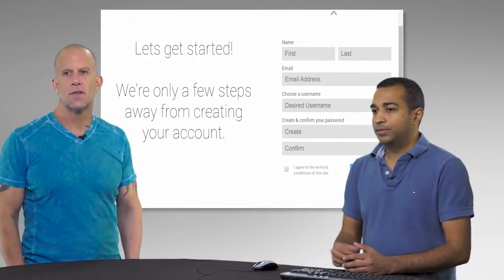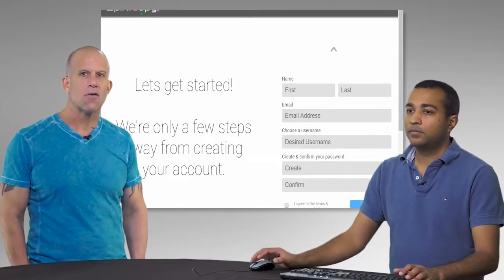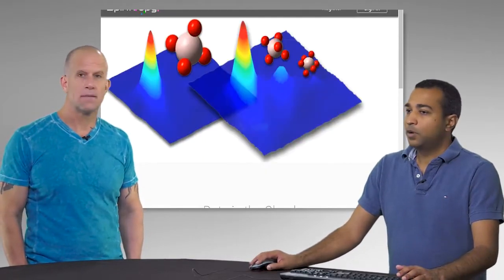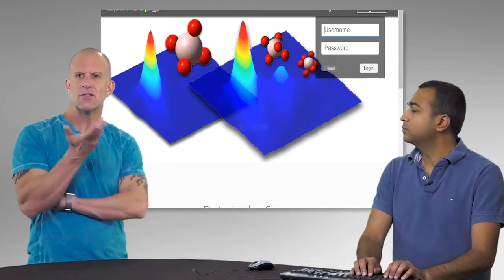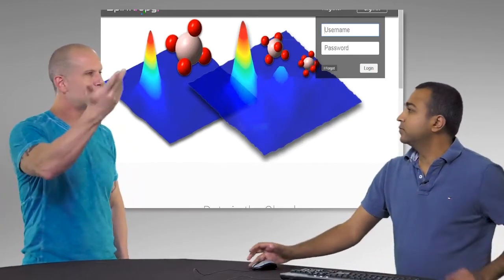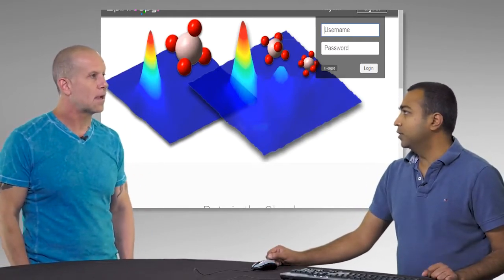Okay, so let's assume that somebody is already registered, so they know their username, right? Right, they'll know their username and password because they set them up. And I assume if they forgot it, there's a forgot link that sends them an email and resets it. Yeah, as long as you remember your username or your email, you can recover your account.